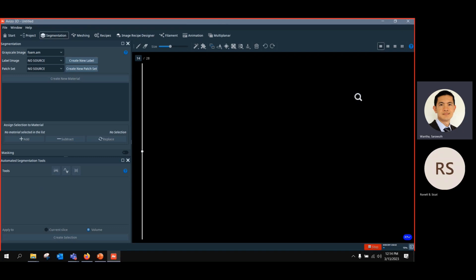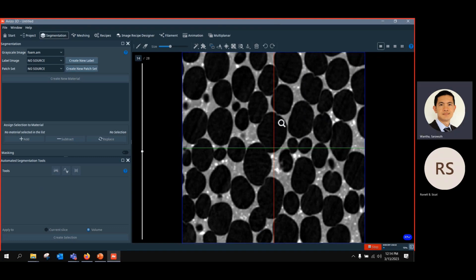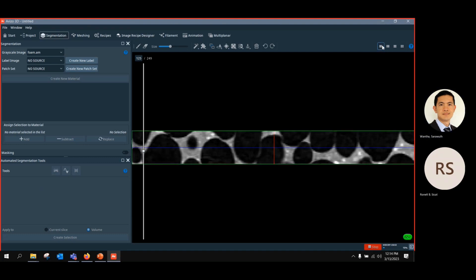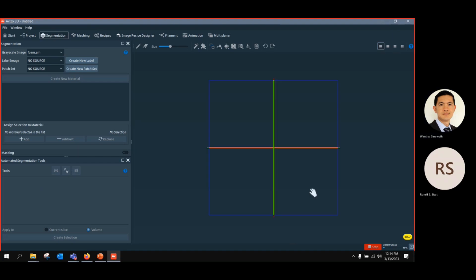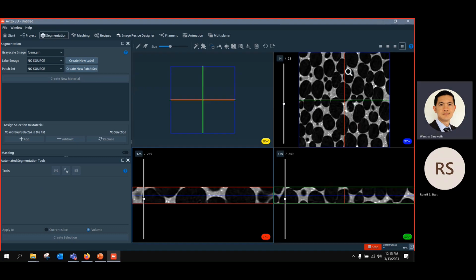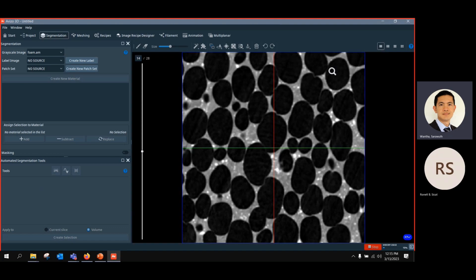When I'm in one panel, if you don't see anything, just assume that the dimension is not right, so press the spacebar until it comes to the viewer like this. So I have only one viewer, but you can still cycle between a YZ view here and an XZ view here and the 3D viewer like this. I hope you can see the four viewers: XY, YZ, XZ, with the color map that you can adjust here. Now I switch to one viewer first and go to XY.